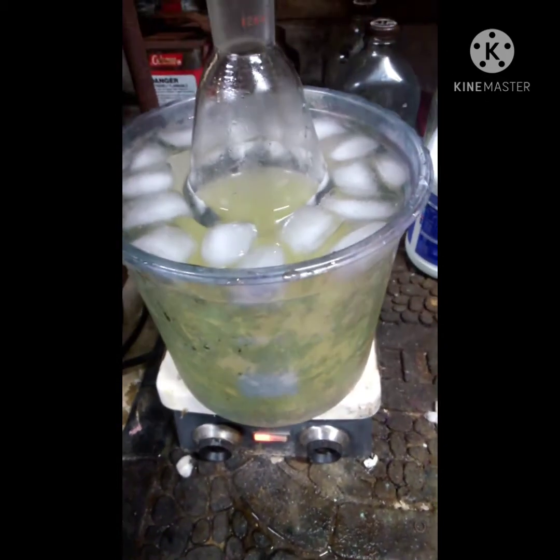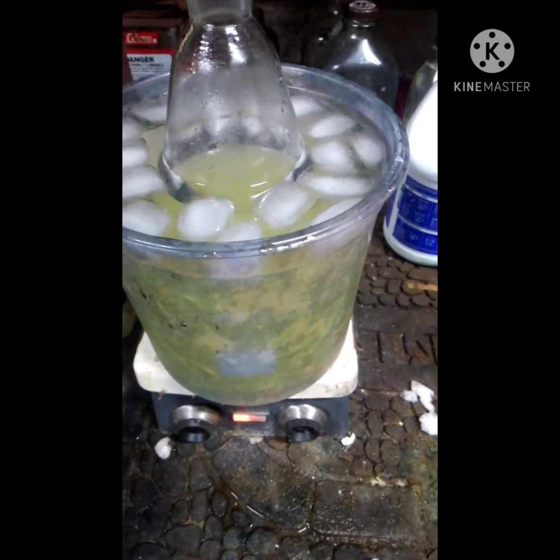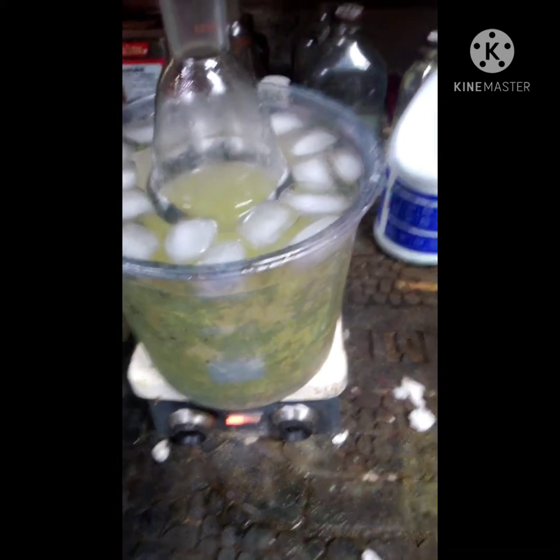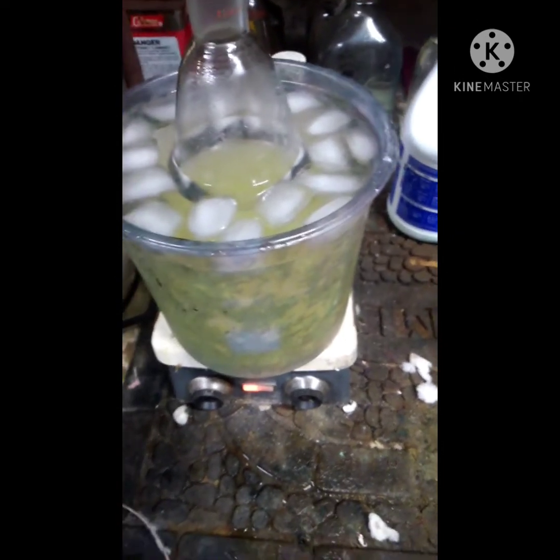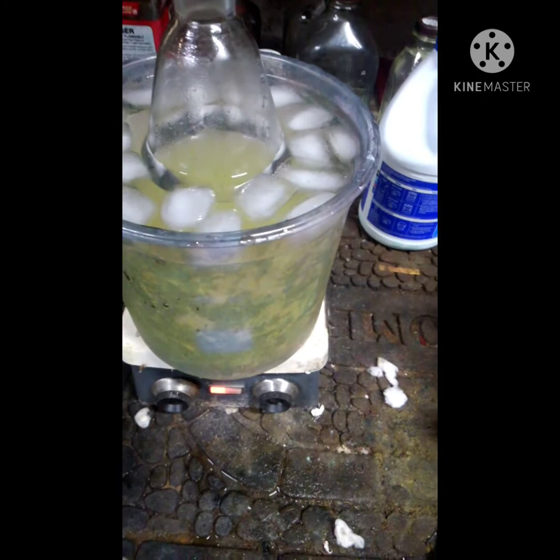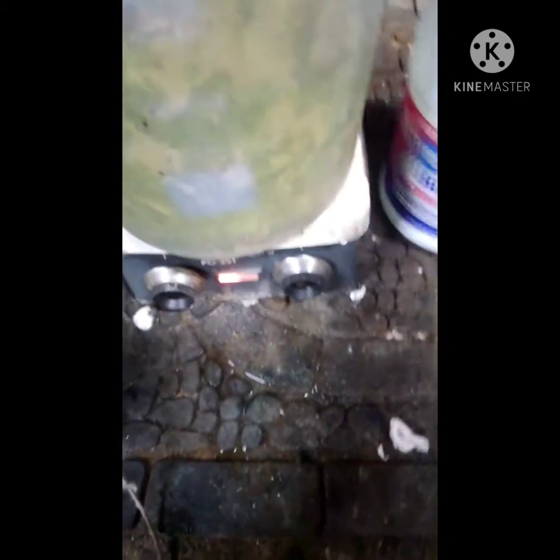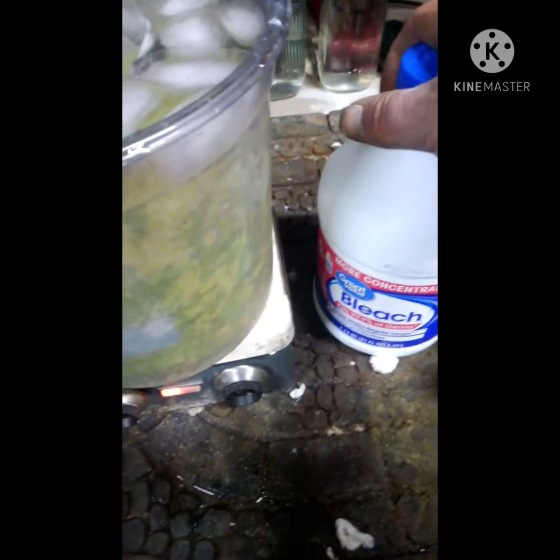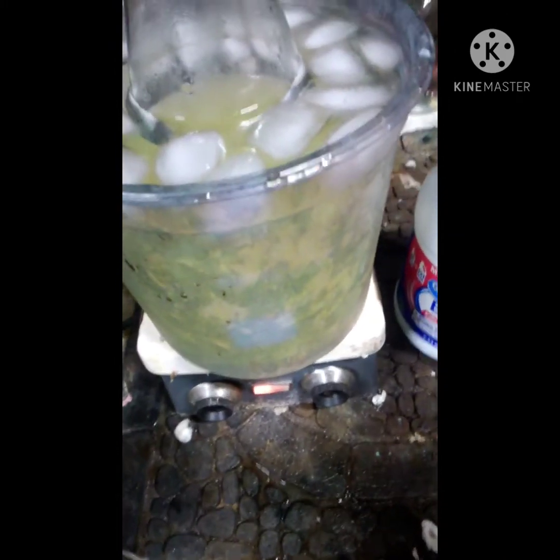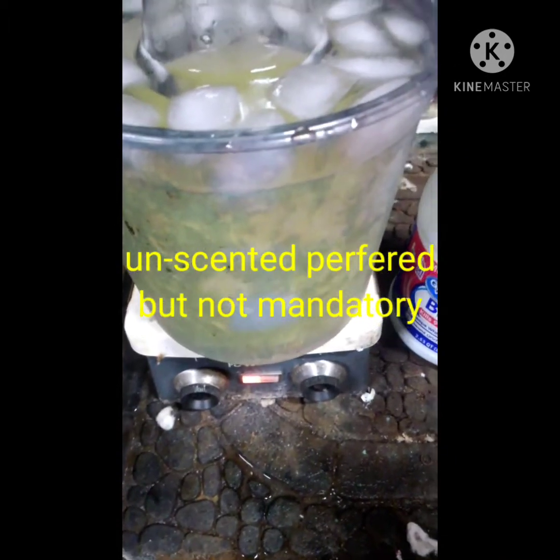What's up YouTubers and YouTubettes. Today I'm going to be making chloroform because I need it for another reaction I'm doing. There are two ways to make chloroform this route anyways - I'm going to take chlorine, which is just normal household bleach, and mix it with MEK, methyl ethyl ketone. The other way is to mix it with acetone.